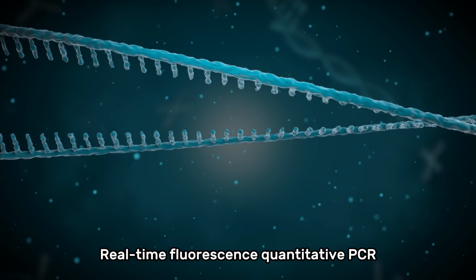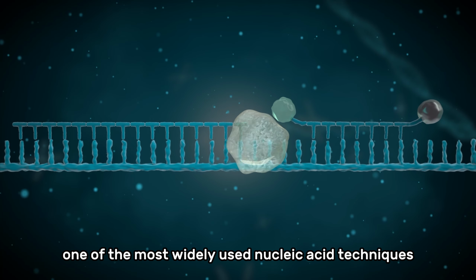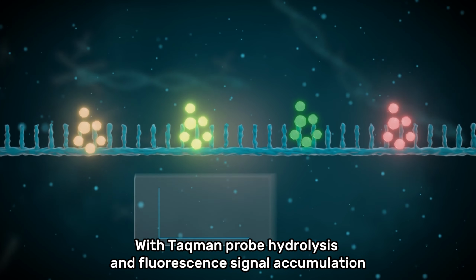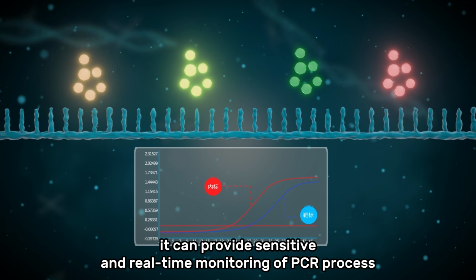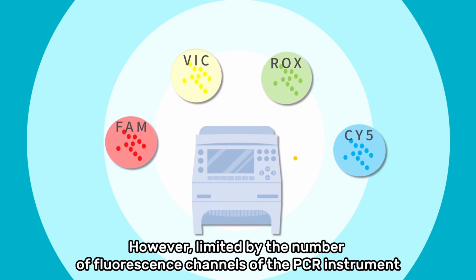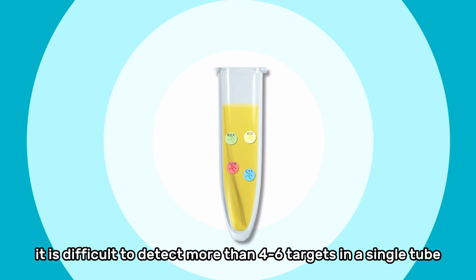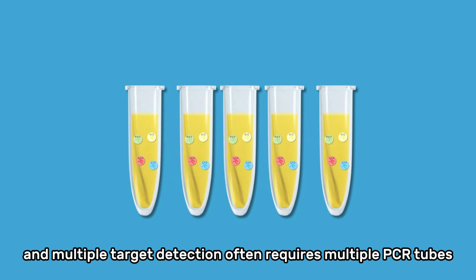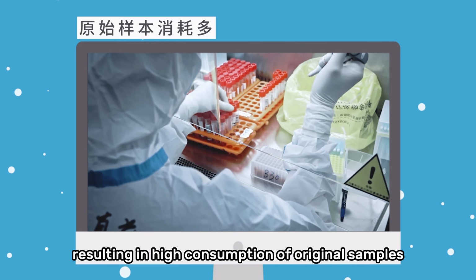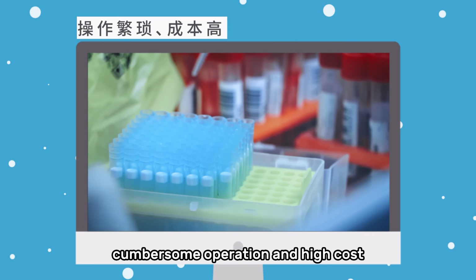Real-time fluorescent quantitative PCR is one of the most widely used nucleic acid techniques, with TaqMan probe hydrolysis and fluorescent signal accumulation. It can provide sensitive, real-time monitoring of the PCR process. However, limited by the number of fluorescent channels of the PCR instrument, it is difficult to detect more than 4 to 6 targets in a single tube, and multiple target detection often requires multiple PCR tubes, resulting in high consumption of original samples, low efficiency of batch detection, cumbersome operation, and high cost.